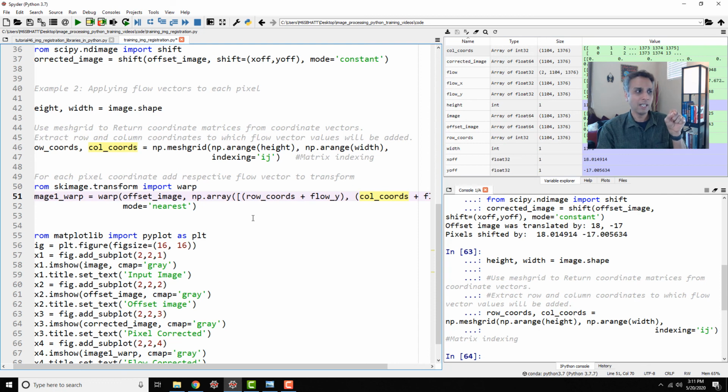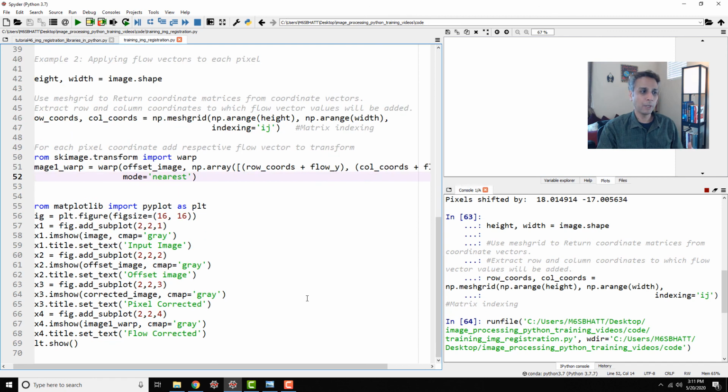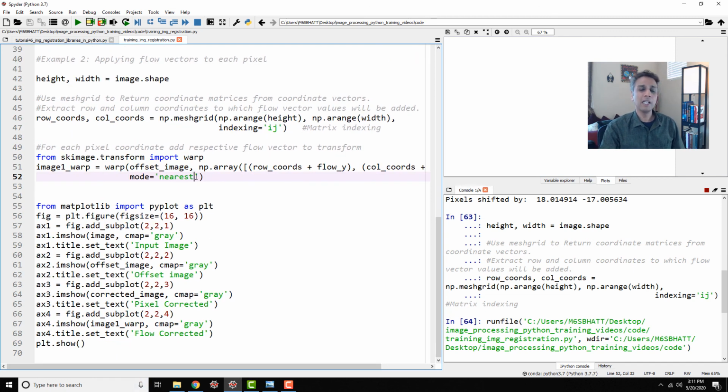That's all. And then after everything, plotting probably doesn't make sense. Oh, I'm running the flow again, so this may be a bit slow, but I hope this makes the point here. So how to apply? Once you get the flow out, you're going to get the coordinates and you're going to move each pixel over there.